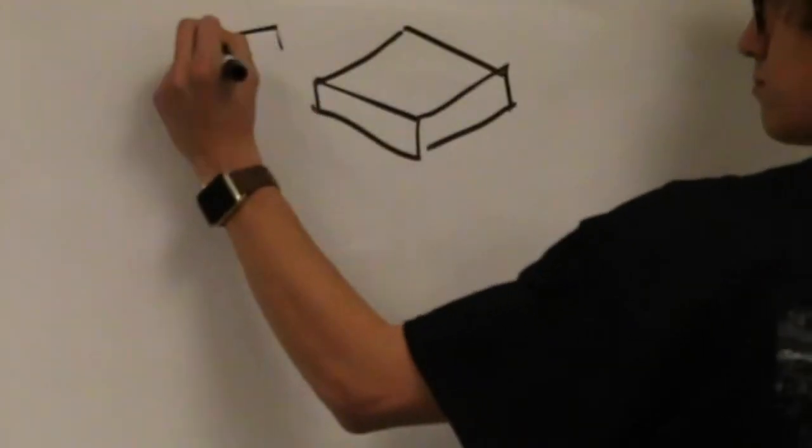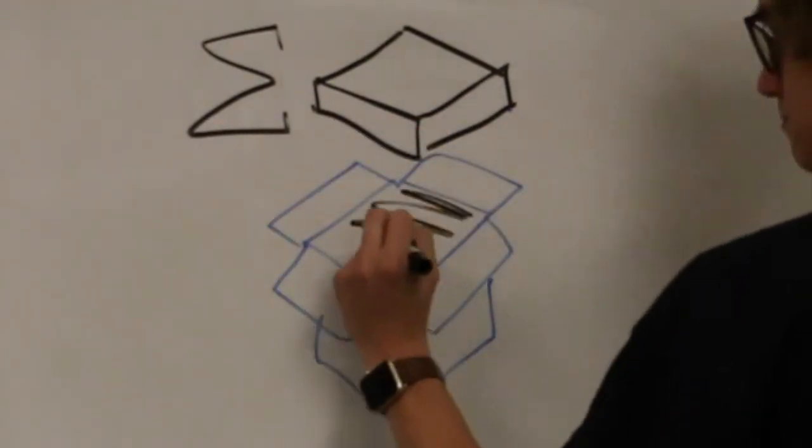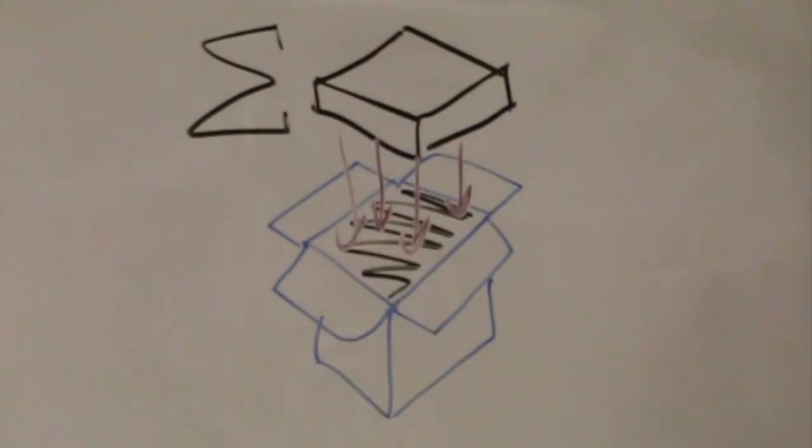Finally, since there are tons of voxels taken per sample and a corresponding 3D model generated from them, a lot of space is needed to process and store every file.